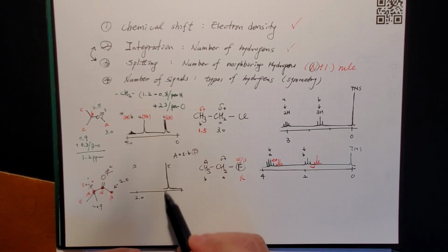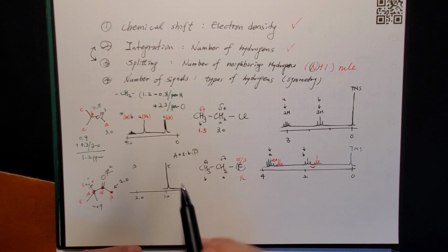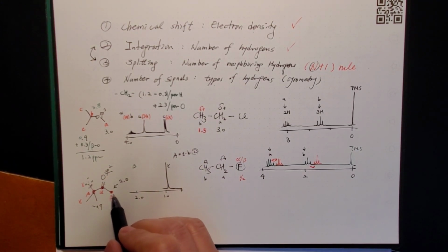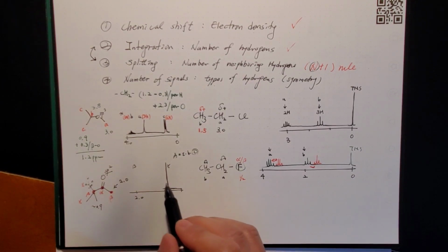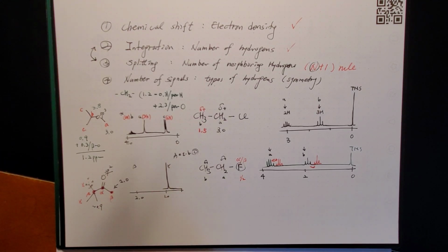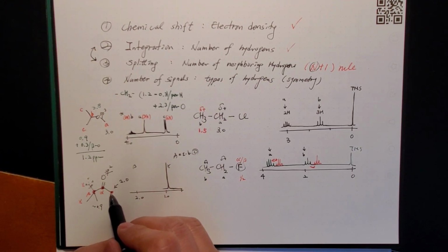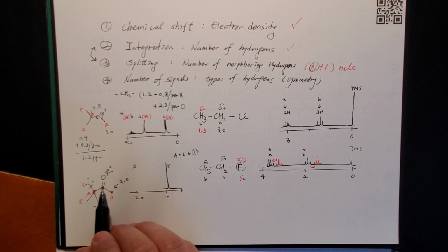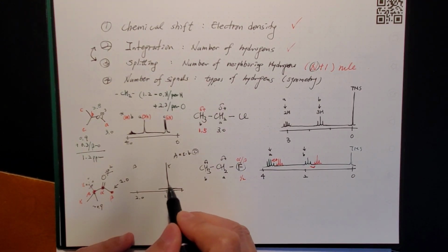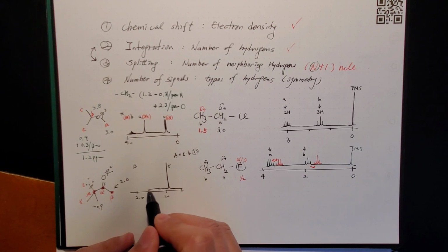So absorption is big, and that's the integration concept right here. Then you have 3 of them. So 1/3 of it. See how many splittings you have. If you have more splitting, then you have to make it even shorter, right? So you look for the neighbor, and there's none. So again, one line, so 1/3 of this.